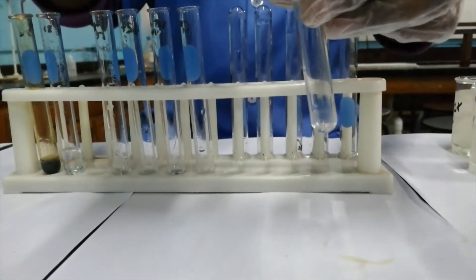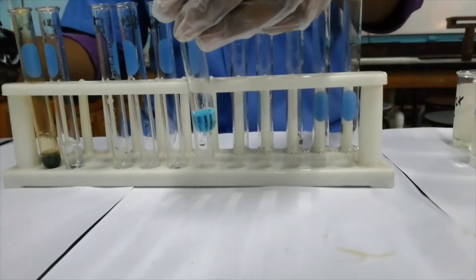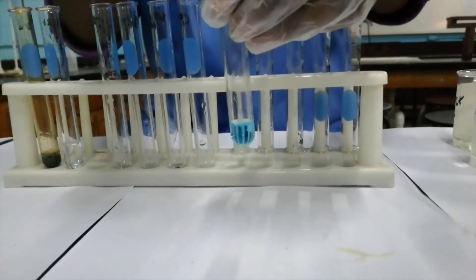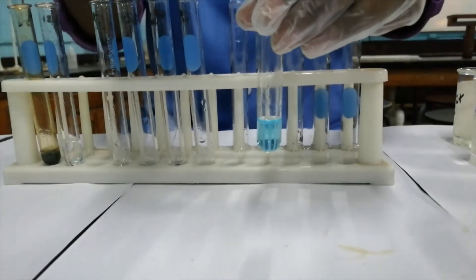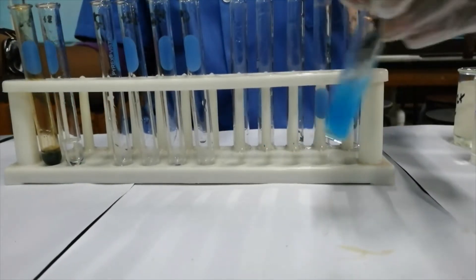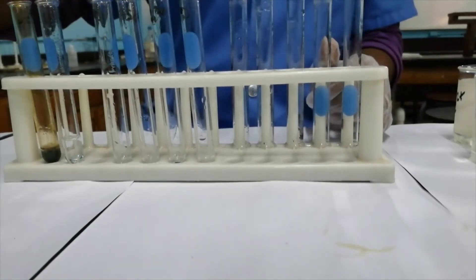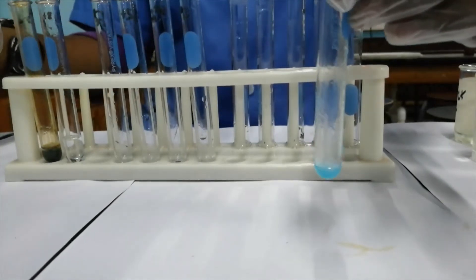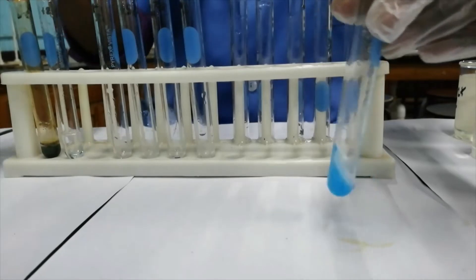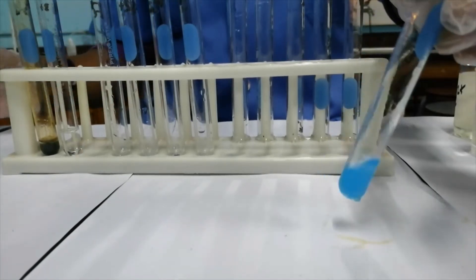The next cation that we'll be testing for will be Cu²⁺, which is of course the copper cation. On addition of sodium hydroxide, a blue precipitate forms. I'm going to pour off most of what is here to test if this precipitate dissolves in excess sodium hydroxide. It does not dissolve in excess sodium hydroxide — the precipitate is still there.